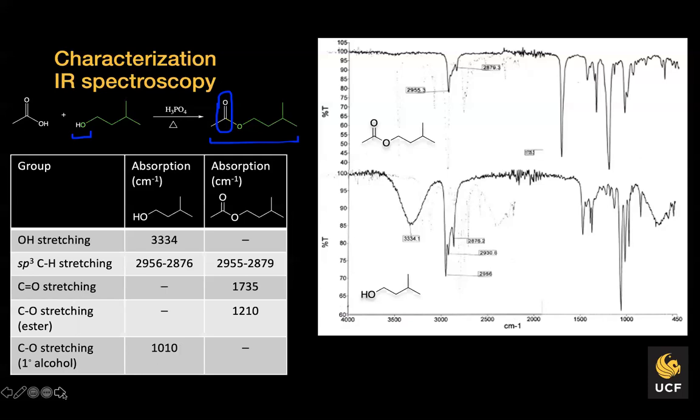So there are other characteristic absorptions that we can tell within the fingerprint region, especially when they're strong and sharp as such. So not only can we tell that we have an alcohol group, this alcohol group, based on its absorption, is actually involved in hydrogen bonding. Alcohol groups that are not involved in hydrogen bonding typically will have a slightly higher wavenumber. It could be anywhere between 3,700 and 3,500, whereas if the alcohol group is involved in hydrogen bonding in solution, it's typically less. So not only is this an alcohol group, but we can tell it's also involved in hydrogen bonding.